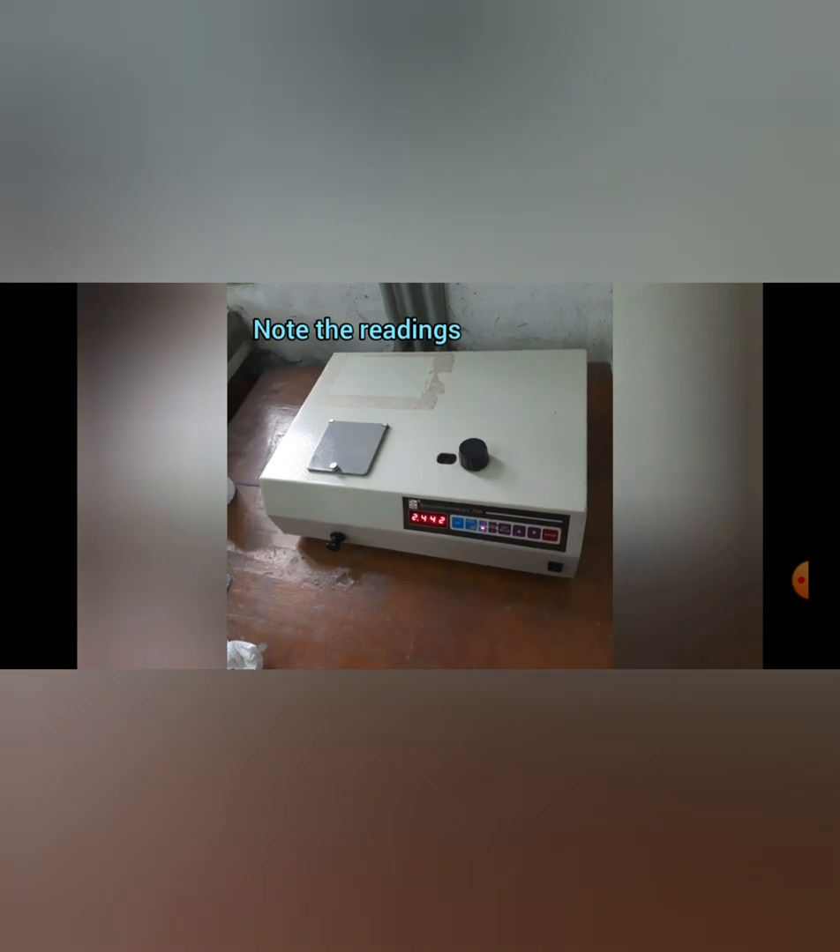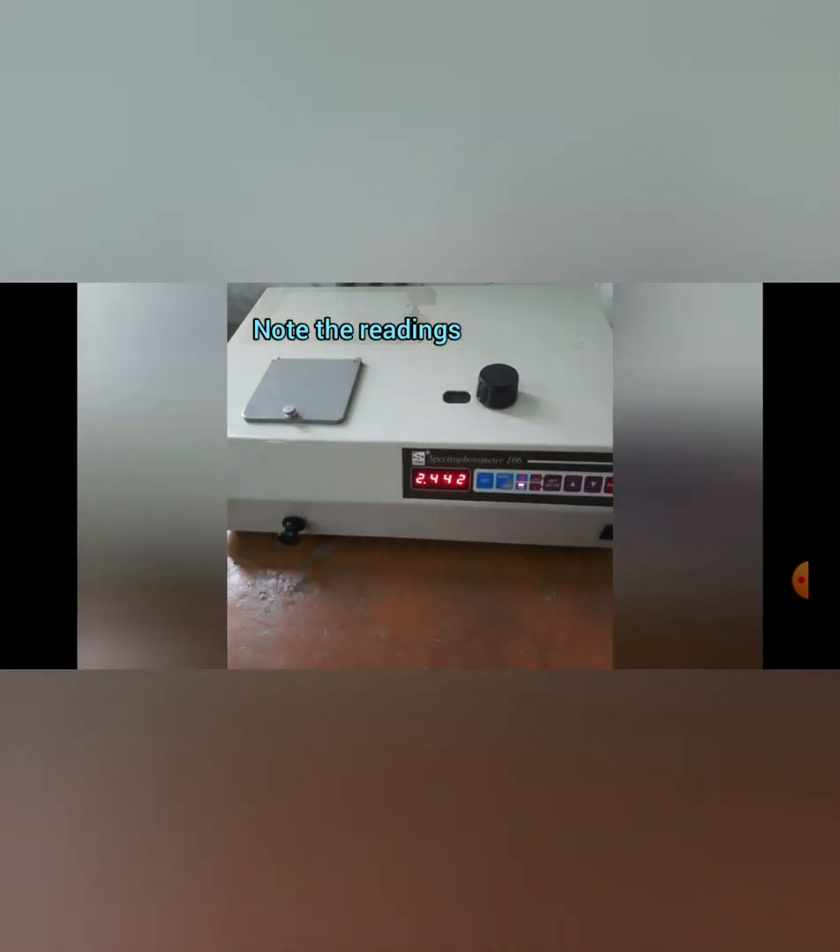Now take the filtrate specimen in another cuvette, then insert it in the spectrophotometer and take the reading. This should be repeated for all five specimens.